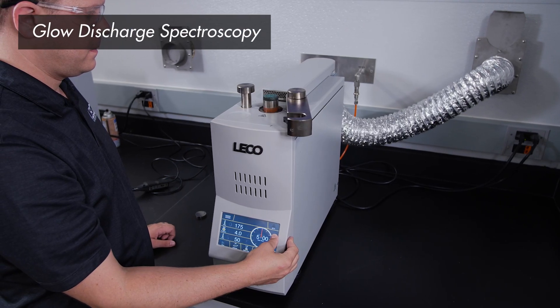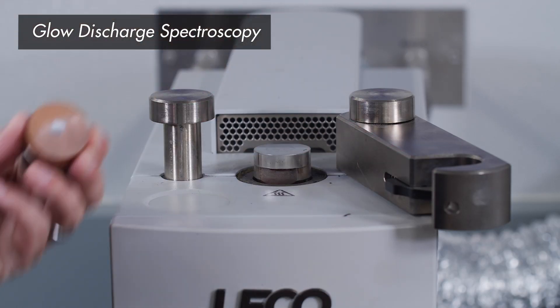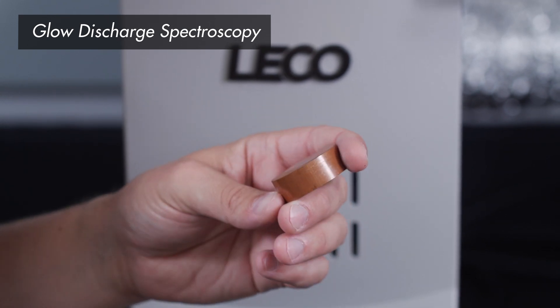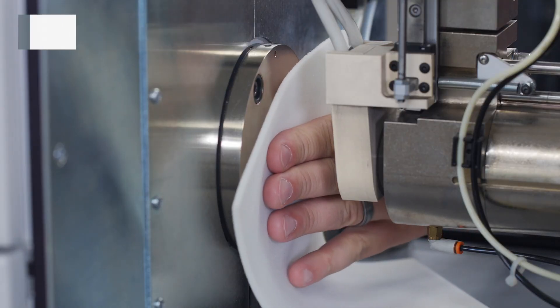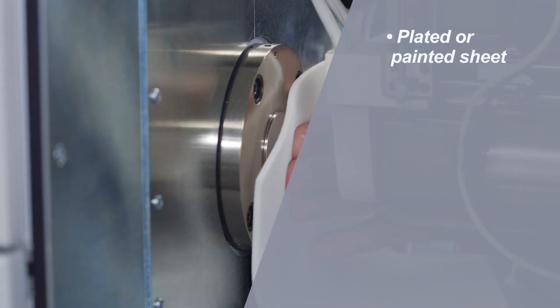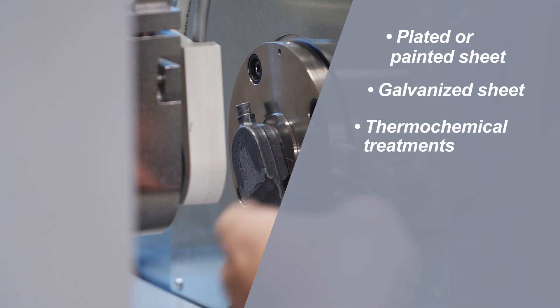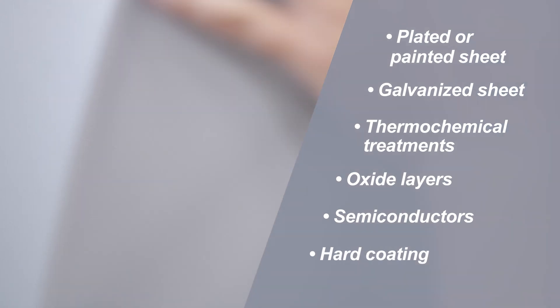The Glow Discharge method, when utilized with CDP software, determines the elemental composition of layered samples as a function of depth. Depth can be determined directly, without the need for thickness standards or depth profilometers. Applications like plated or painted sheet, galvanized sheet, thermochemical treatments, oxide layers, semiconductors, and hard coating are all supported.